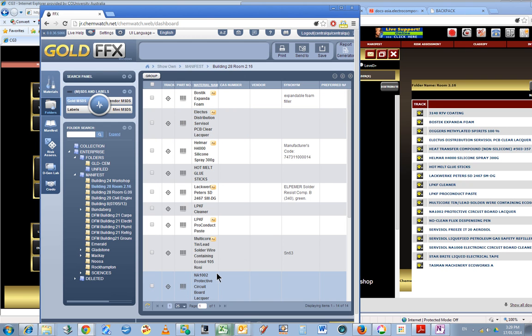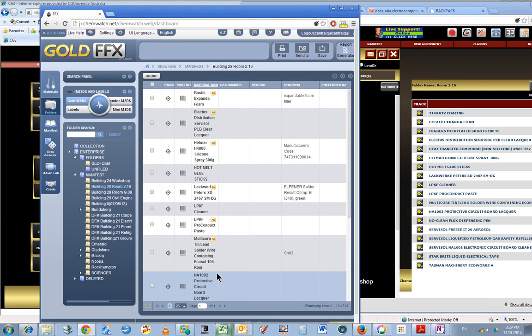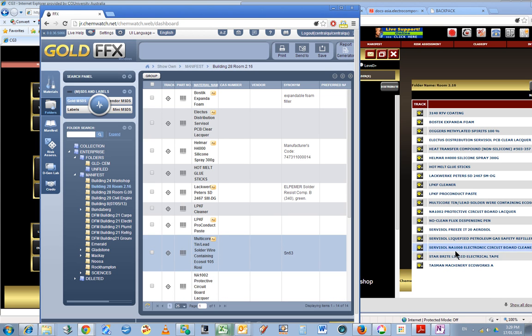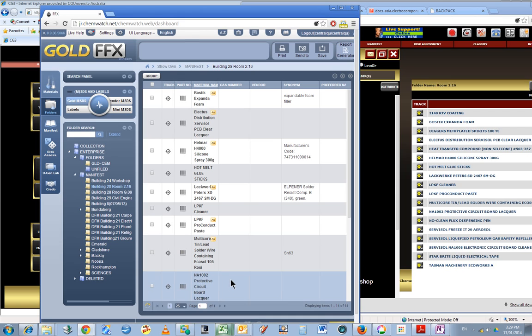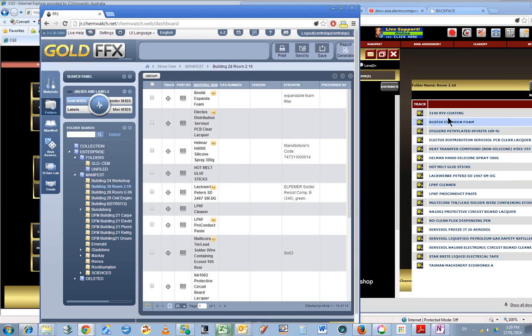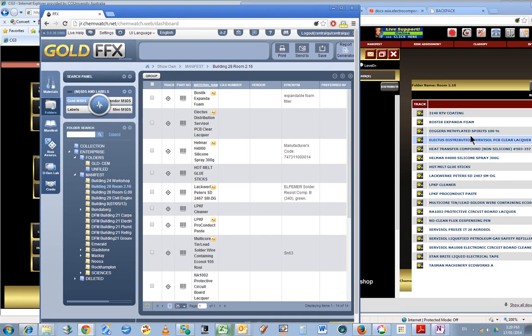They obviously copied all the data across at some point, perhaps last year. I heard that the new FFX system came into being halfway through last year. So I will have to update this new interface with those MSDS sheets all over again.